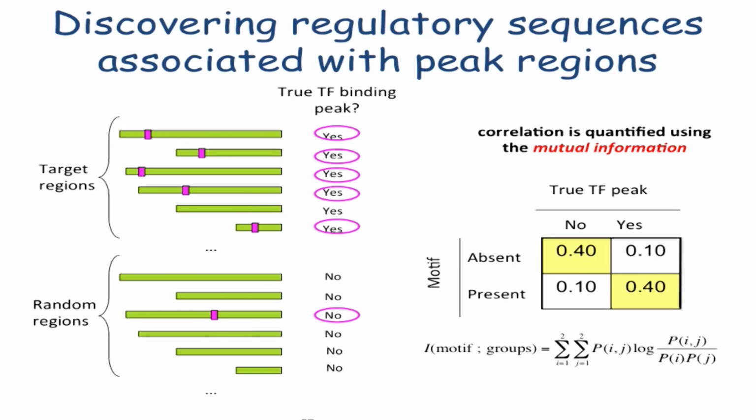And you could want to get a sense whether there are motifs that tend to be enriched in one set of peaks and not in another set of peaks. It's the same idea. It's really containing the same idea about information between motif presence and absence across peaks and the labels of those peaks. Again, you can really generalize this notion to multiple categories and not two categories. The application of this analysis to two categories is basically discrimination between two sets of sequences.